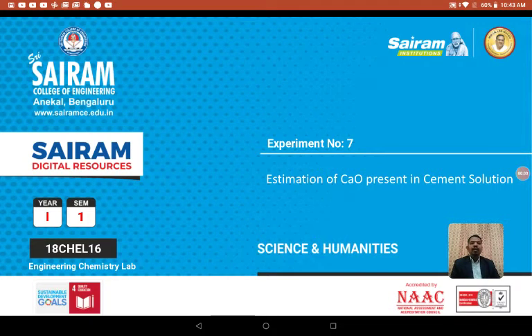Good morning. In our previous experiment, we discussed how to estimate the total hardness of water. Today, let us discuss how to estimate the percentage of calcium oxide present in cement.